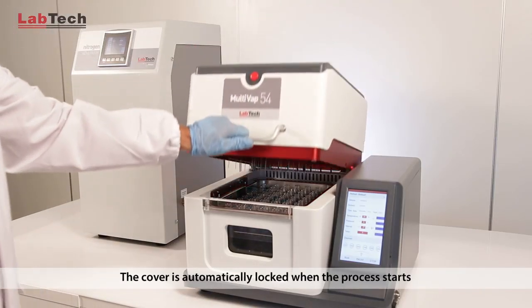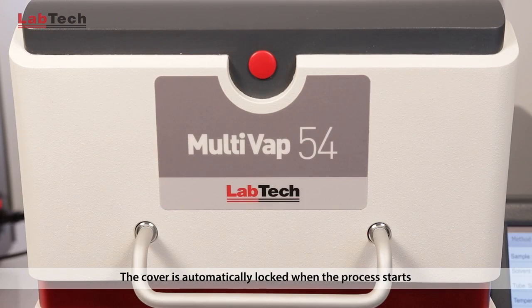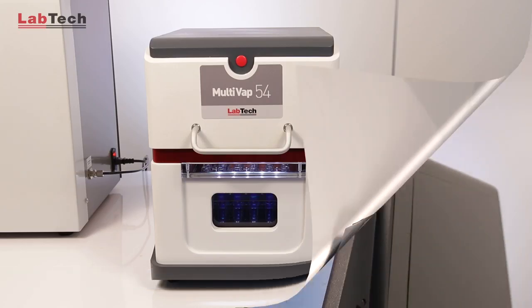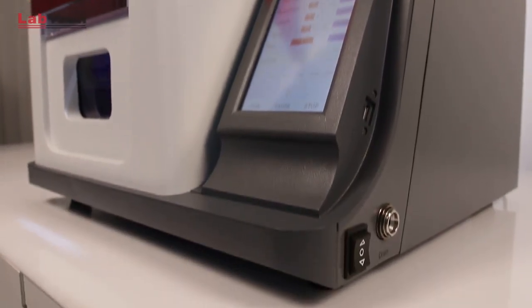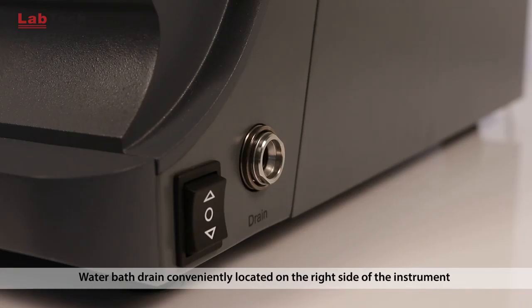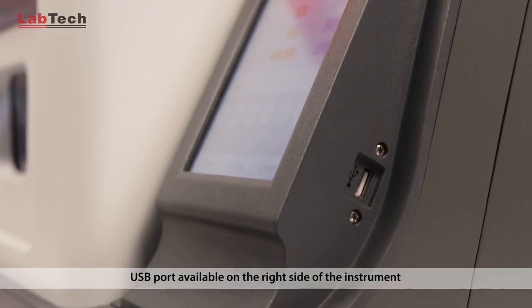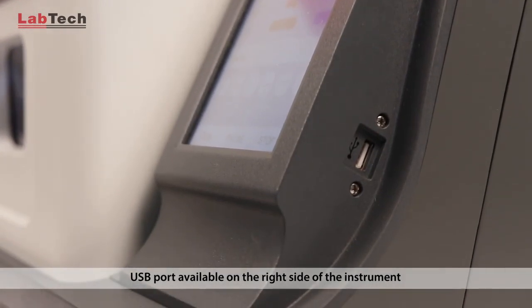The cover is automatically locked when the process starts. The water bath drain is conveniently located on the right side of the instrument, along with the useful USB port.